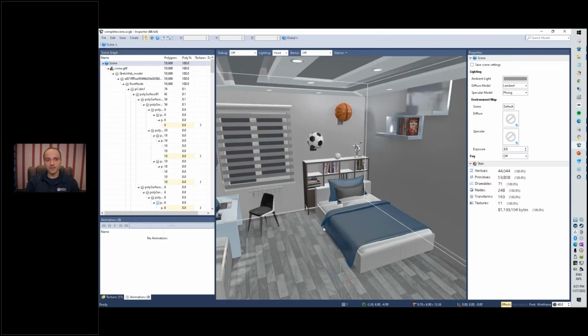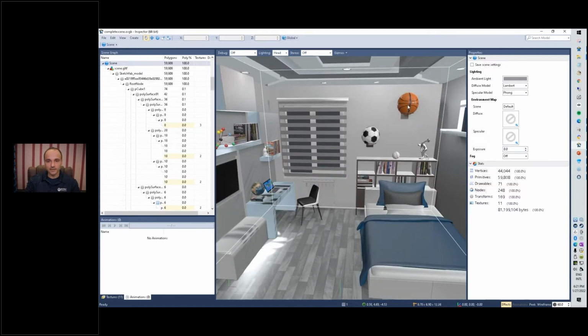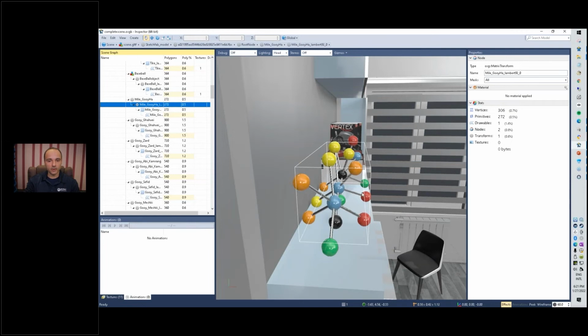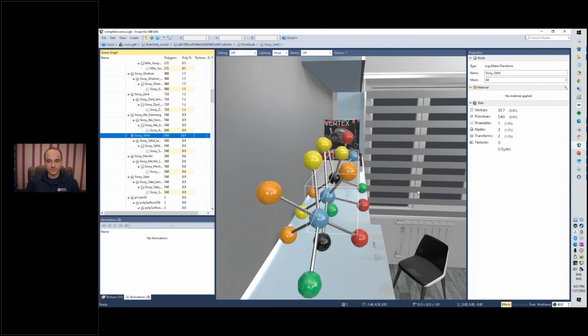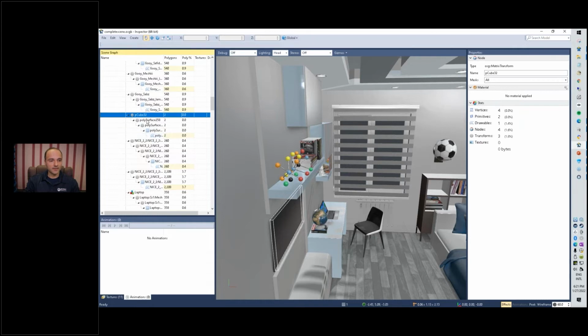You can do things like resize objects, rename them, etc. But I'll show you what I did do. If you click here on one of the objects, for instance, here we have the basketball. Initially it wasn't called basketball, so we had to tell the program somehow that this is an object that should be tracked in the program. Here we have a bunch of these objects. Let's see what else we can find. Here we have the TV. That's the TV object.